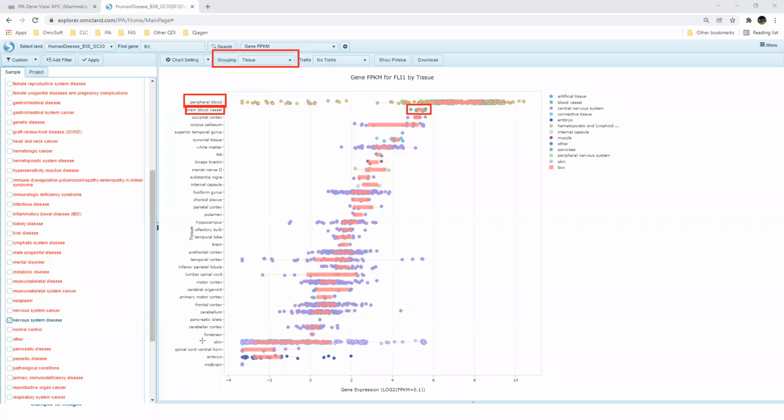And then skin and spinal cord had relatively negligible expression. So this is one way you can decide. Let's say if you're thinking of planning an experiment where you want to work on this gene, maybe this will provide you with some information on which tissue type you should be selecting from, let's say, your samples that you're collecting.